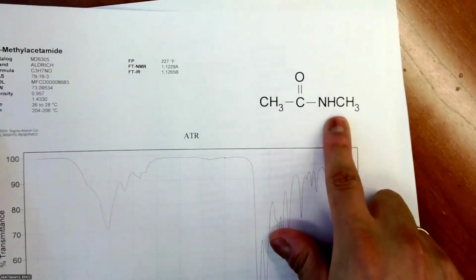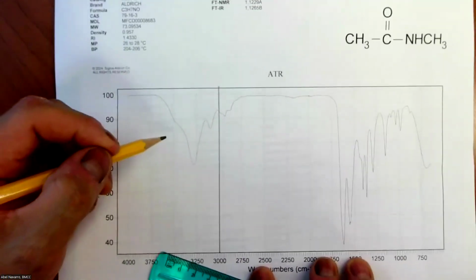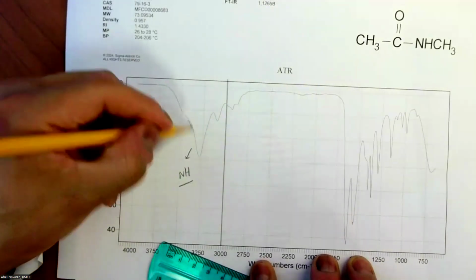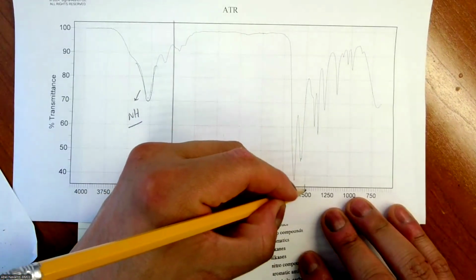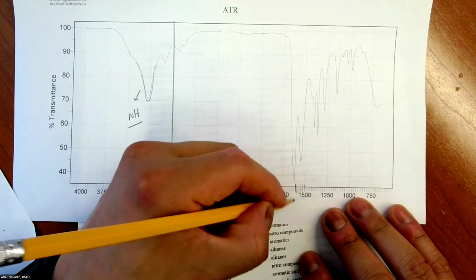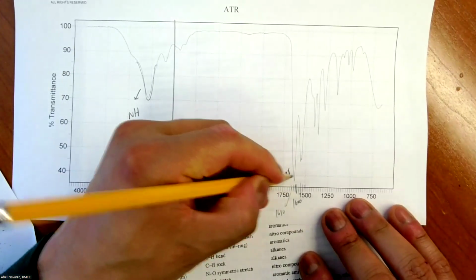3000 line, and that's an NH. Only one peak. Therefore, it's only one single NH. And here I have the C double O, around 1625, 1650. Yeah, about the same thing, 1625.